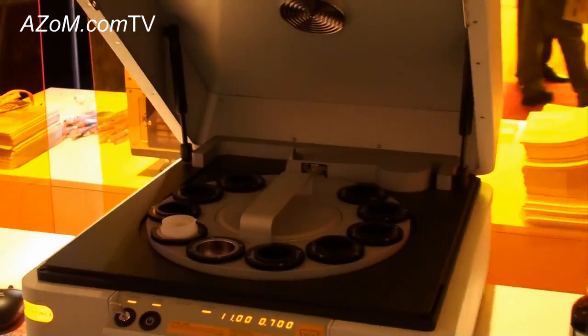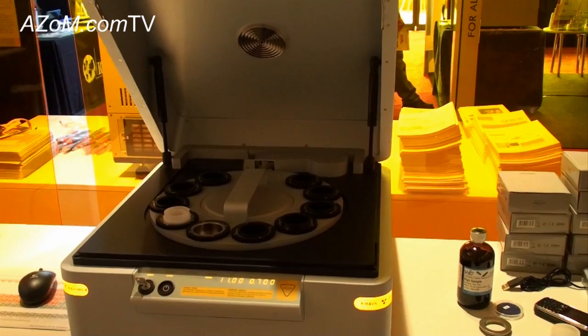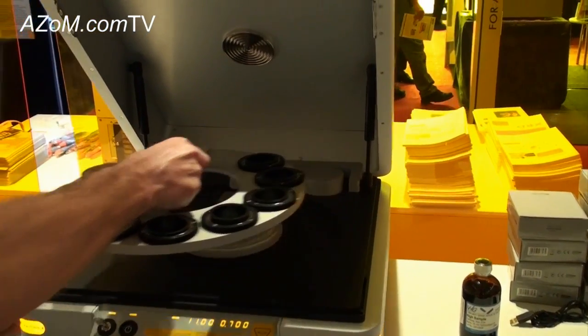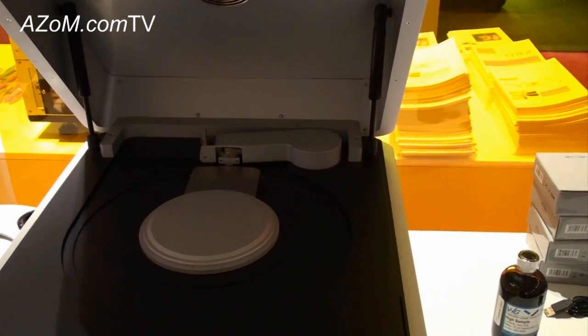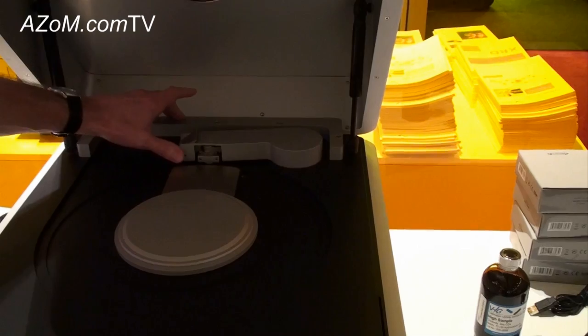We've talked about standard samples. One of the other possibilities with the Epsilon 3 XL is to measure larger samples which are not mounted. In this case, we remove the sample carousel like so — it's a very simple mechanism. We can rotate the sample spinner mechanism out of the way, like so.